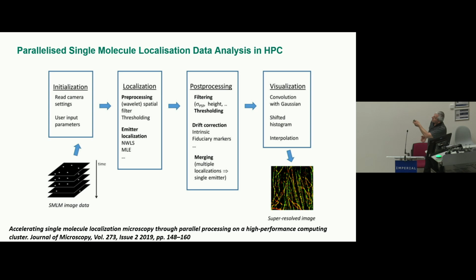You get many frames, up to 40,000, 50,000 frames. Now you send this to the HPC environment. In this way, we want to get all the coordinates of every single frame. The localization process is the one that requires several computer nodes in order to get all these tables of localizations. And then all goes back into a single node, and that node basically renders the image.